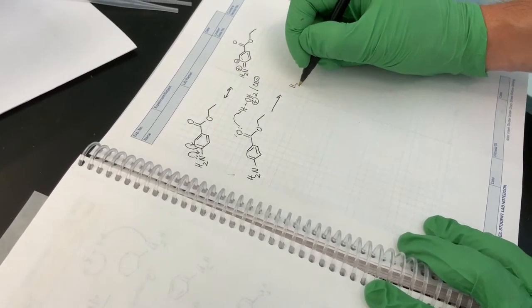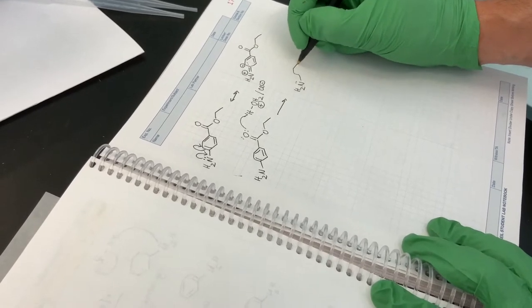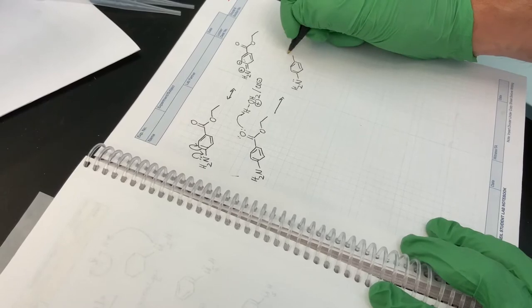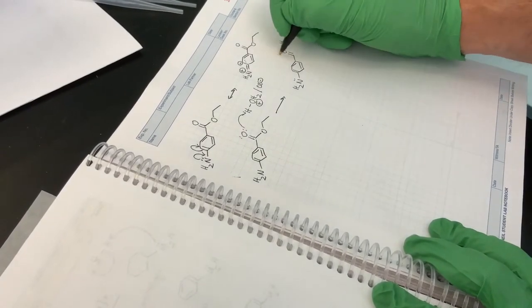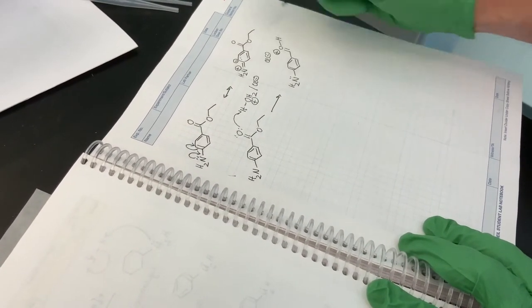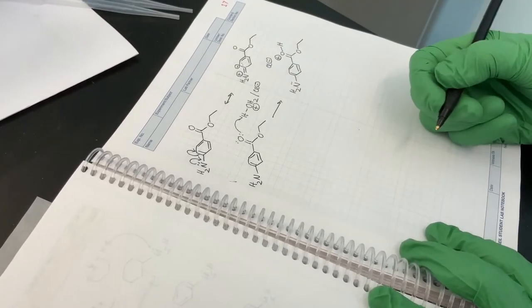And you might be saying, well, we know that the amines are basic, what's going on here? Well, we're not protonating the nitrogen lone pair electrons once again, because then we would destroy resonance stabilization. So now this conjugate acid, which we would call protonated benzocaine, has multiple resonance structures.